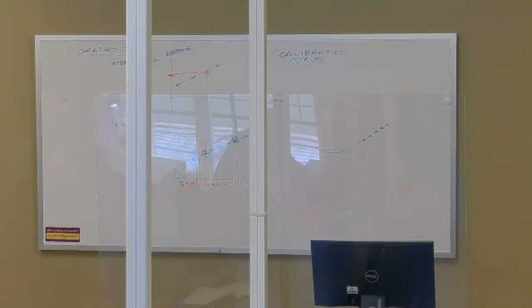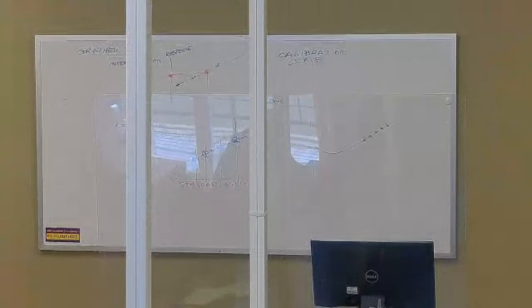There is a tiny drop inside of here of an internal standard. I can't remember what this is. It's water or alcohol. I can't remember what that is. But it has a tiny little speck inside of it, something called tetramethylsilane. TMS has an NMR signal exactly at 0.